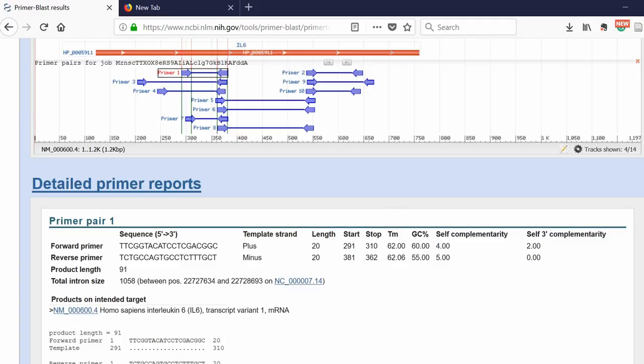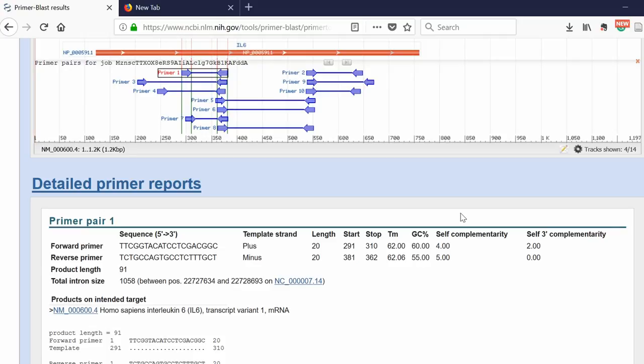The melting temperature, the GC content, and then the two at the end. These are self-complementary scores that the Primer Blast algorithm calculates for the likelihood that the primers will bind to themselves and to each other. You want these scores to be as low as possible.